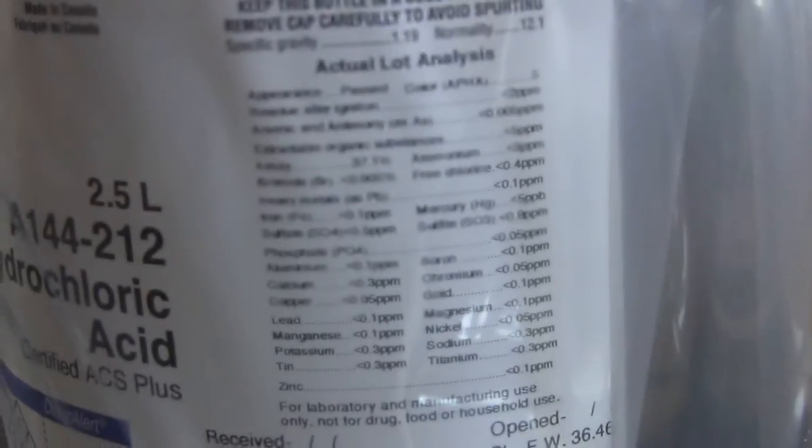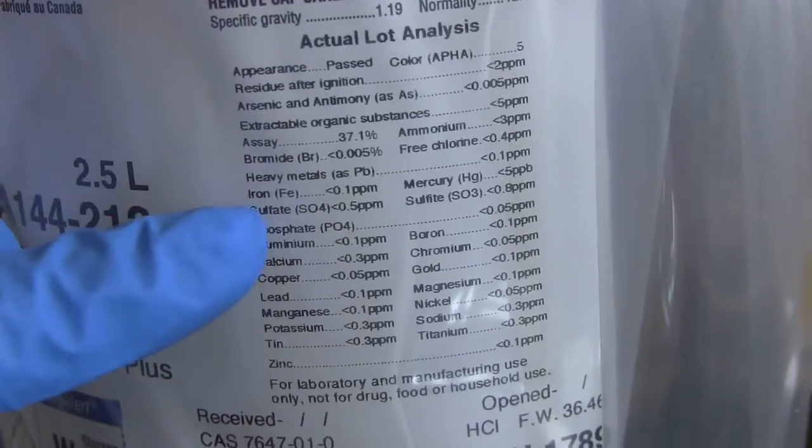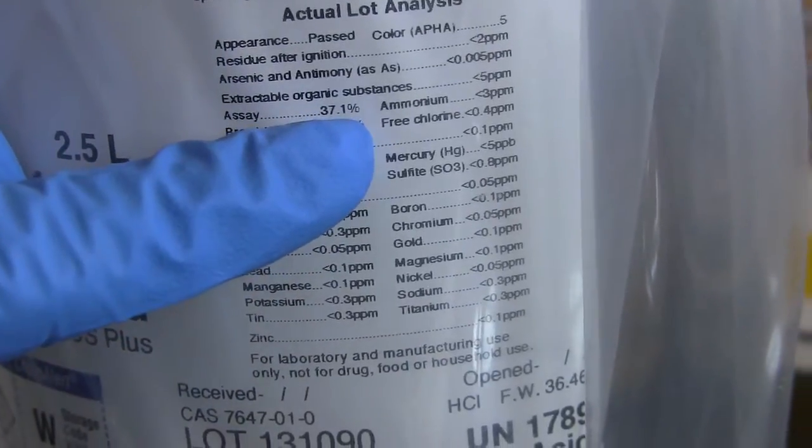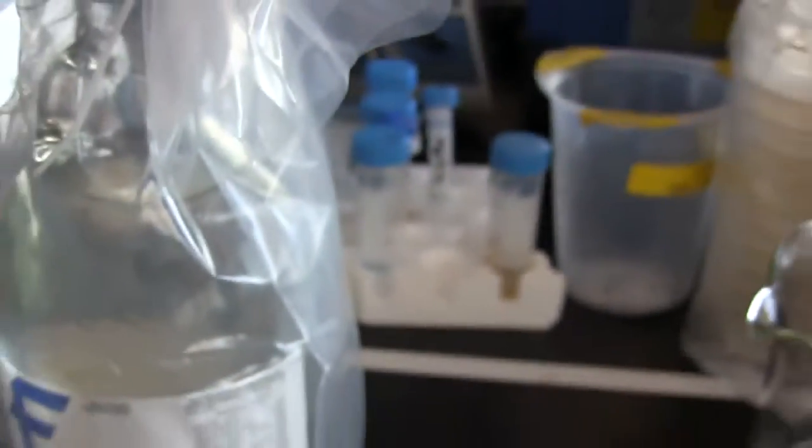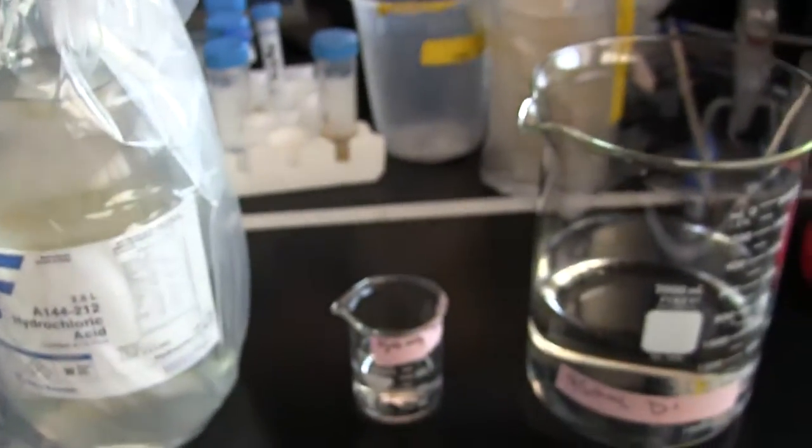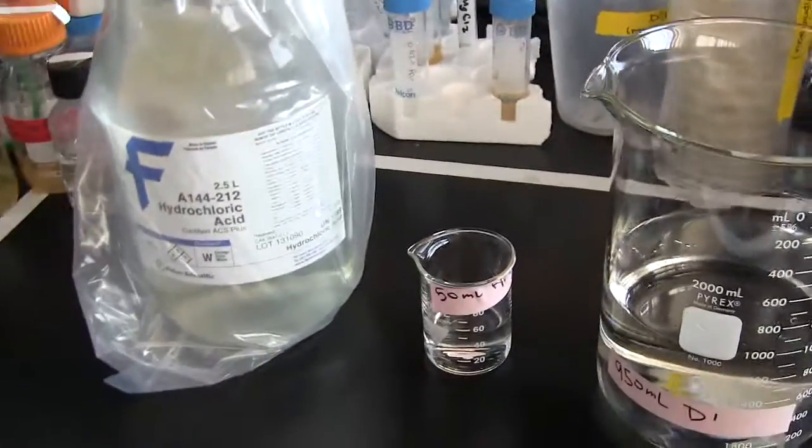What you need to know is that concentrated hydrochloric acid from the supplier has a concentration of 37%. Concentrated hydrochloric acid is always between 32% and 38% when it comes from the supplier.